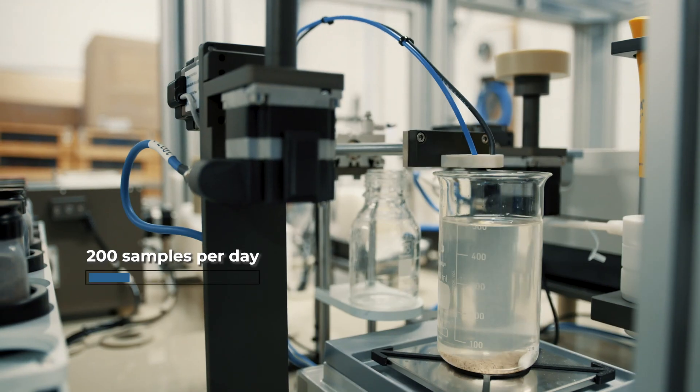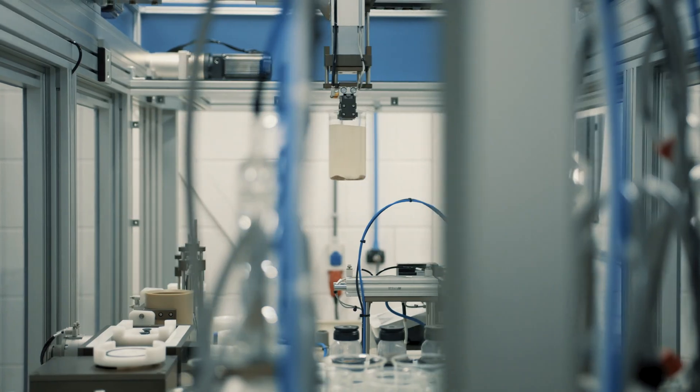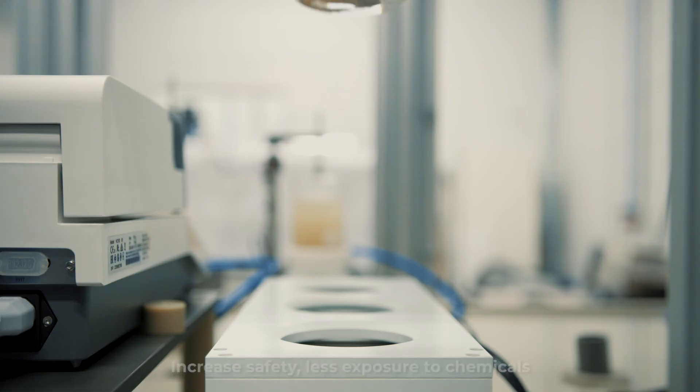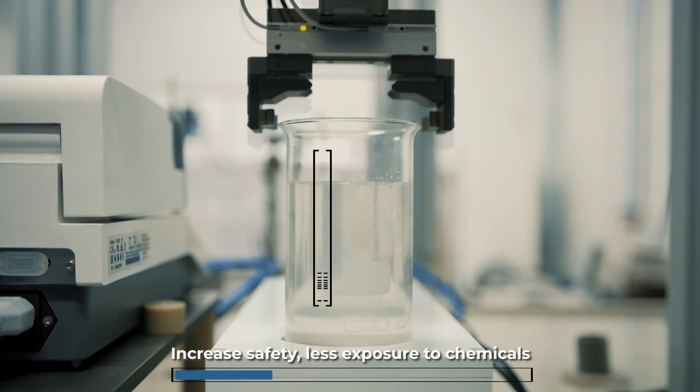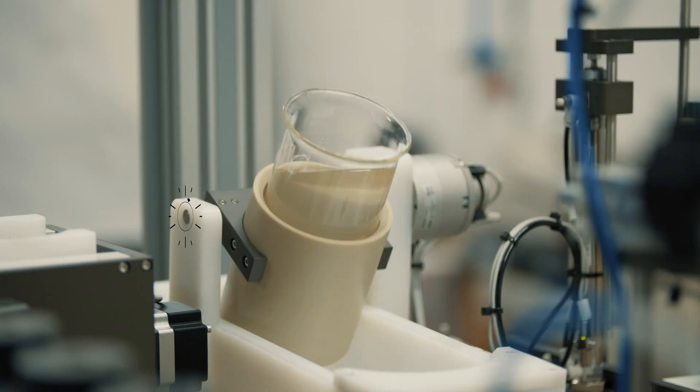Speed combined with accuracy is everything. Rapid adjustment, saving on raw materials and a higher quality end product.